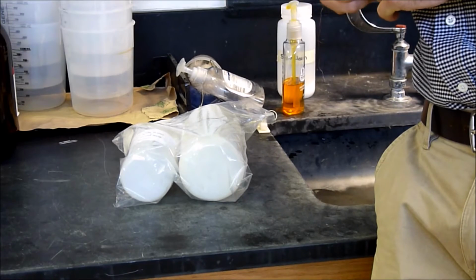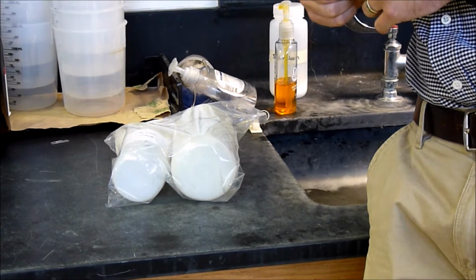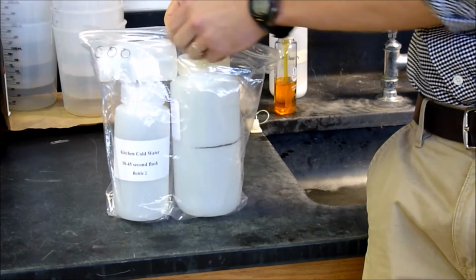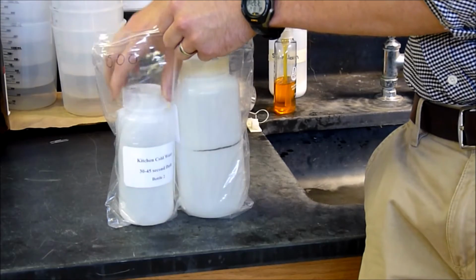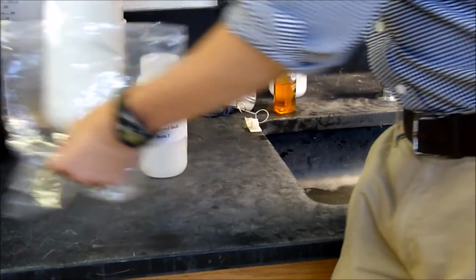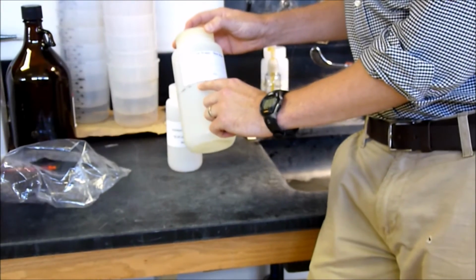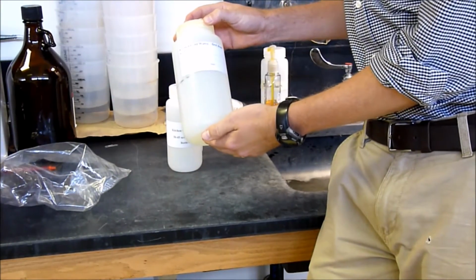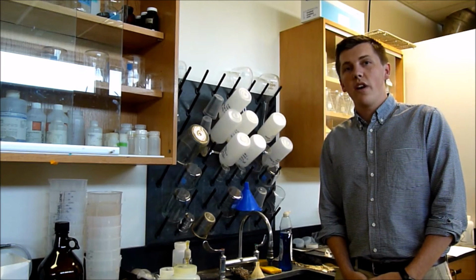After you've thoroughly read all the instructions and filled out the information on the instruction sheet, you can then unpack the 3 sampling bottles from the package by just removing them from the plastic bag here. And the biggest bottle has additional information that you need to fill out, similar to what's on the instruction sheet. So go ahead and fill that out before sampling any water. Now you're ready to begin sampling.